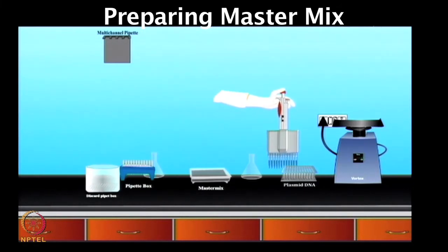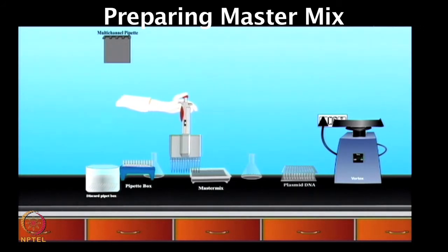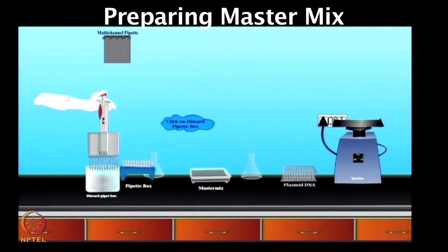Once the master mix is added to all the wells in the block, then you need to shake the plate for 15 minutes.